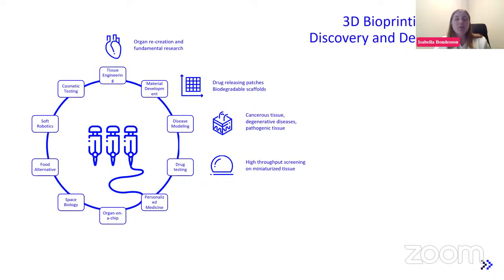And to these models, how much complexity is brought into them can be designed and decided depending on the application. They can be advanced both in terms of personalization by using patient-derived cells, for example, for targeted drug screenings, or in terms of adding additional components such as flow or additional tissue types. So here is where the organ on a chip or multi-tissue models come into place.